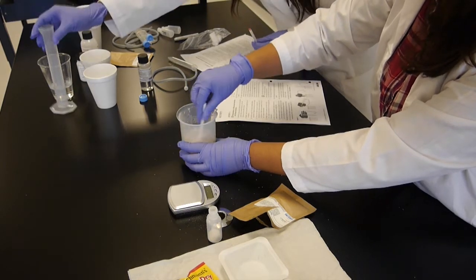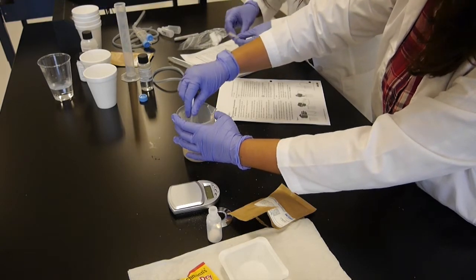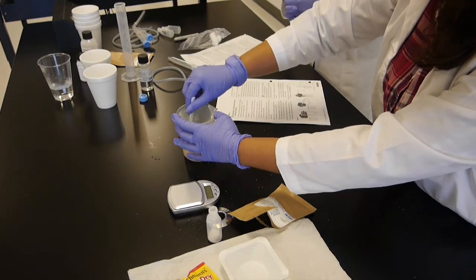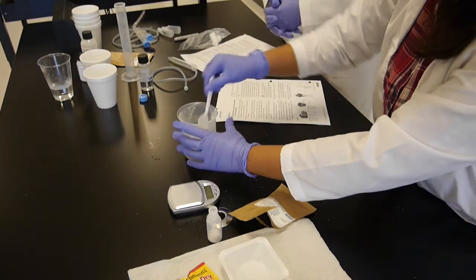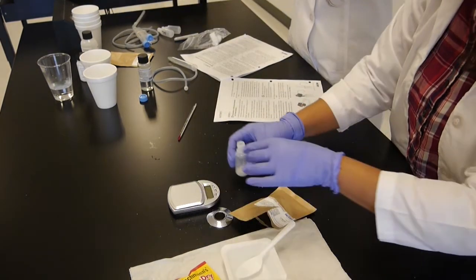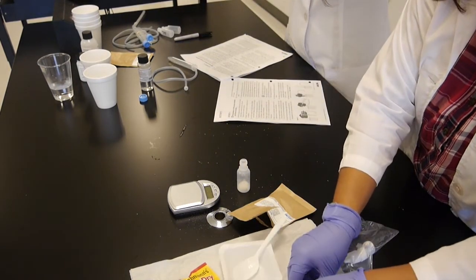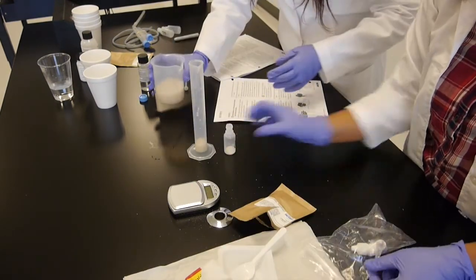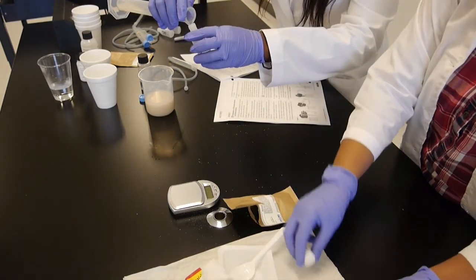Now we're going to need about 6 ml of this yeast solution, and we'll add it to the sucrose. There you go. Six milliliters. There you go. Pouring this into the sucrose bottle.